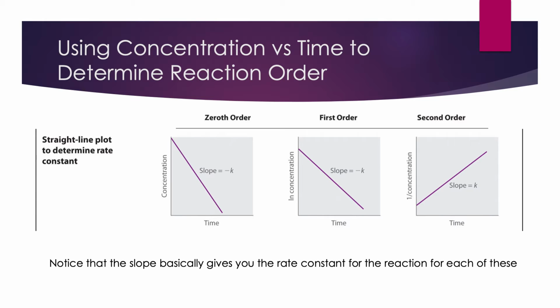And so now you have a more definitive way to really look at and compare, all right, for the data you have, is it closest to 0th order, first order, or second? And again, in a perfect world, hopefully from what we did last week, if you plot natural log of concentration versus time, hopefully that comes out linear or as the best linear fit. If that doesn't, again, don't worry about that.